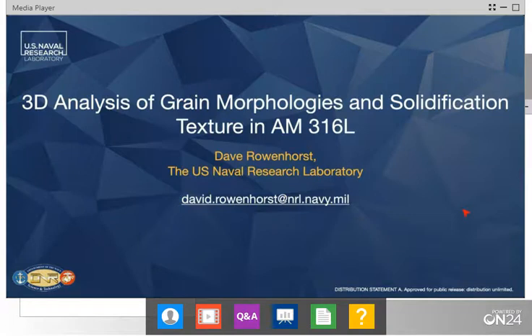I really appreciate the chance to present at the seminar today and talk about this 3D analysis. We're going to be talking about how we look at materials in 3D, why we use EBSD, and why that is so important for looking at these additive microstructures that we're seeing. I'll be concentrating on one data set today. It's going to be additively manufactured 316L, but it's quite a dense data set, so there's actually quite a bit of information.